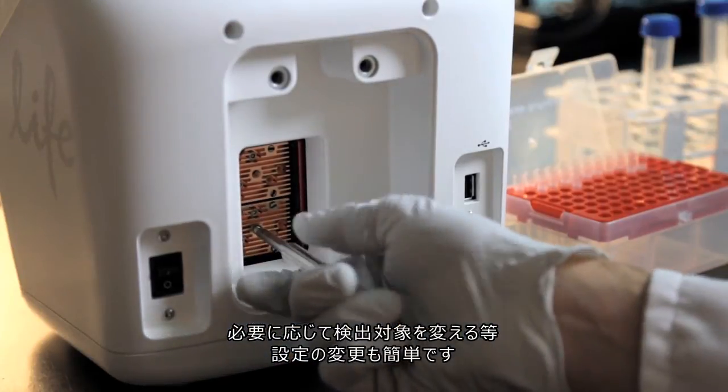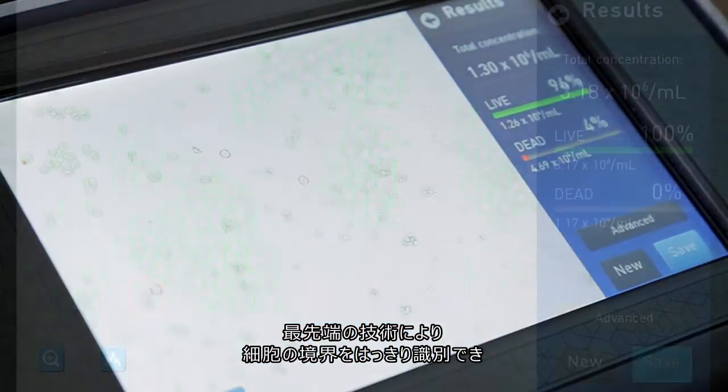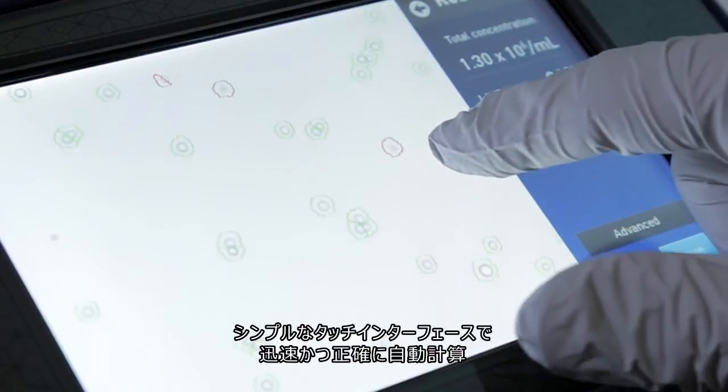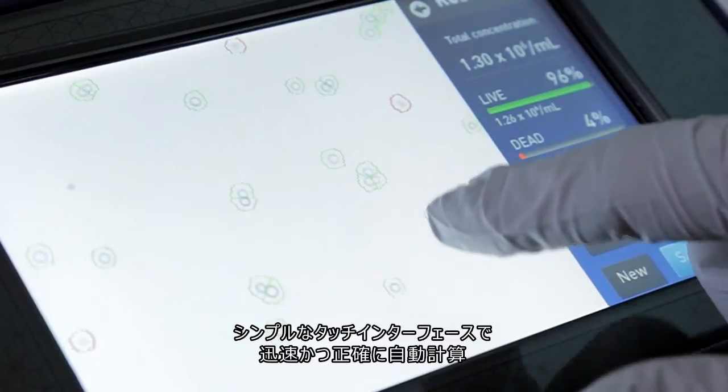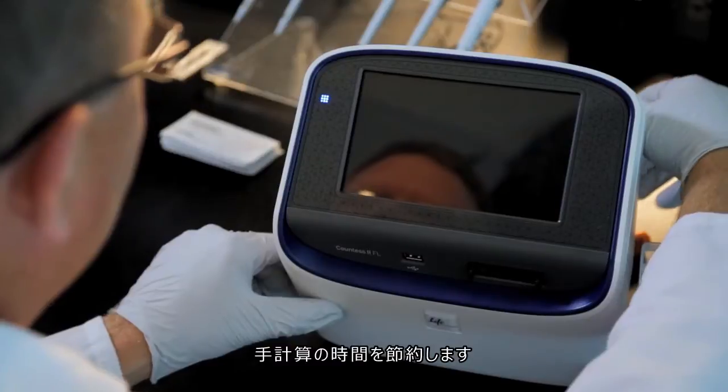Allowing the system to grow with your changing needs. The advanced counting algorithms can identify clear delineations of cell boundaries, providing accurate results even in samples with clumpy cells, all with a simple, intuitive user interface to enable fast, accurate, automated cell counting, eliminating the need for tedious manual counting.